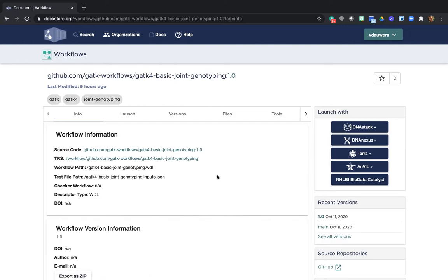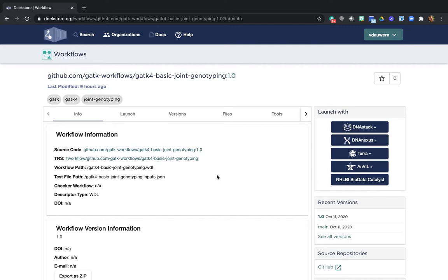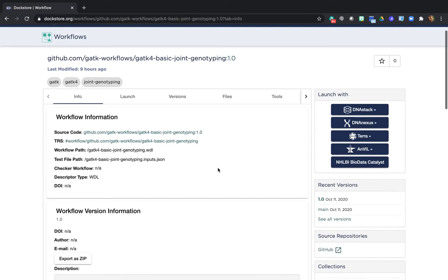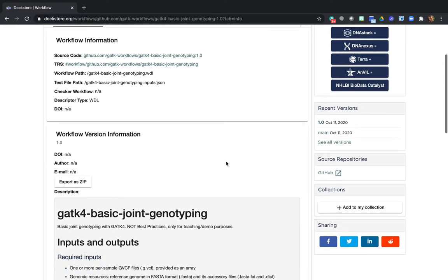And this is actually a workflow that we created for this workshop so that we could show you the basic principles involved in joint genotyping, but without having to deal with the complexity of the full pipeline. So this is a simplified version, not best practices, but good for teaching. Now you see the provenance information, including a link to the source files in GitHub version and so on. And if you scroll down a bit, you'll see the workflow documentation.